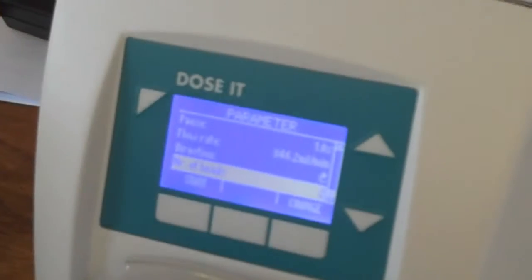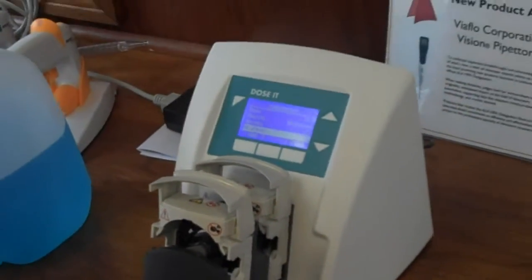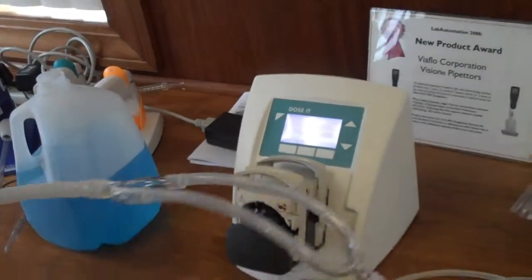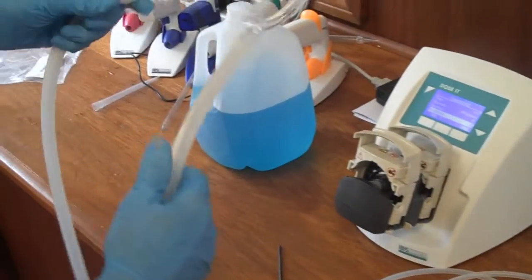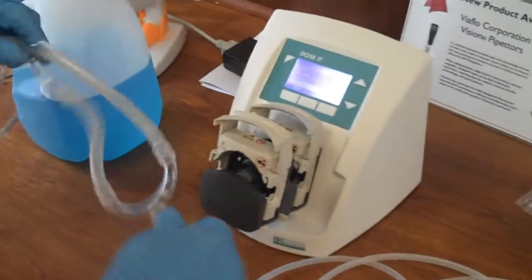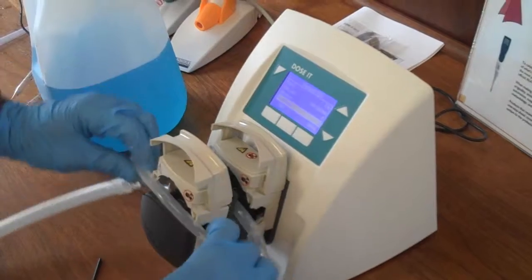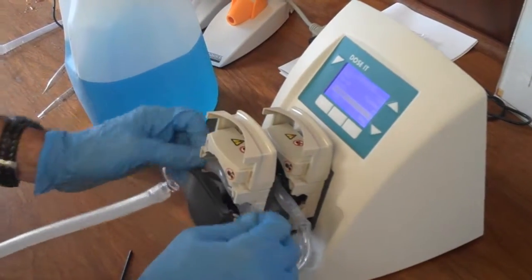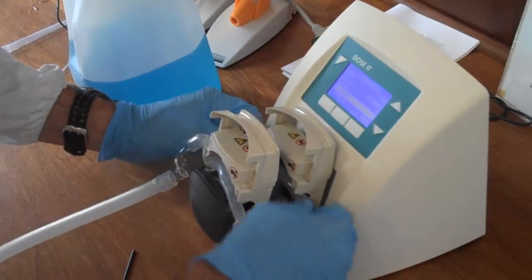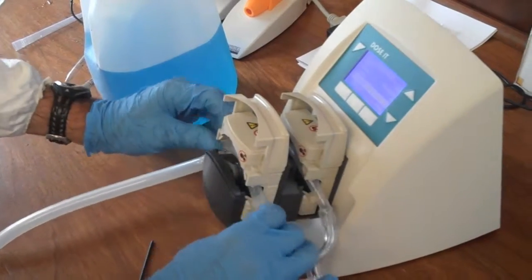Now I've told the device that I have two pump heads. This is a dual pump head tube — this is our large diameter, or eight millimeter diameter tubing. It's what you would use for large volumes, one liter or larger dispensing applications. I'm just going to connect this on to the pump heads — very simple to do.